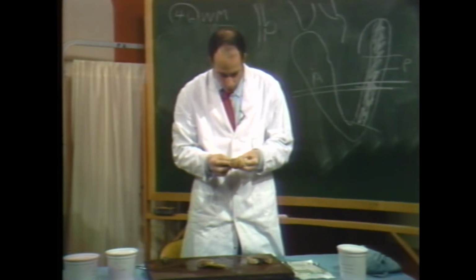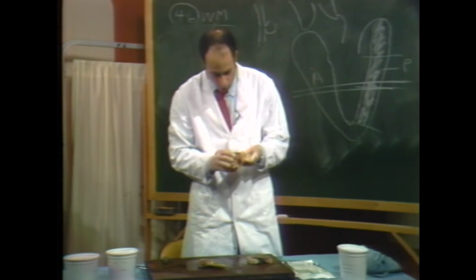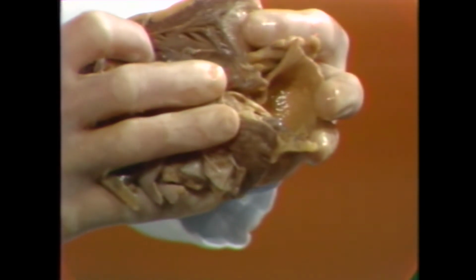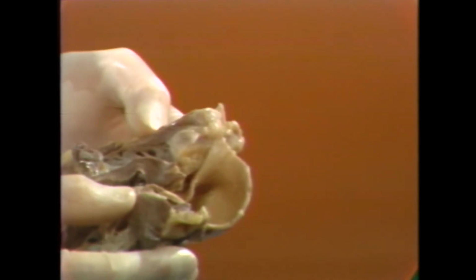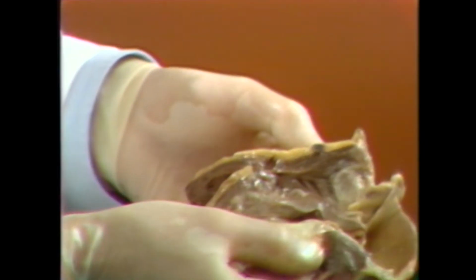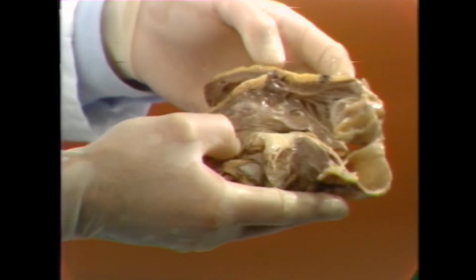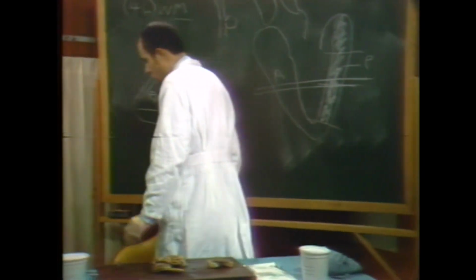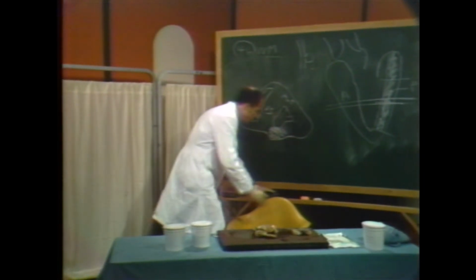Now, this patient, I presume, also has cancer. This is the RV, and there's a little tumor nodule right there. It's black inside. Is that melanoma? Well, the black, I predict, would represent hemorrhage in the center of that little tumor nodule rather than melanotic pigment. And there's a little RVH. I would tend to think that this fella had more than one problem.